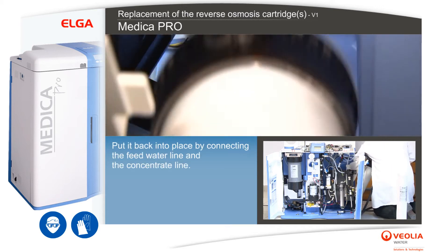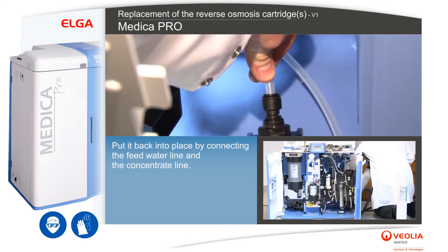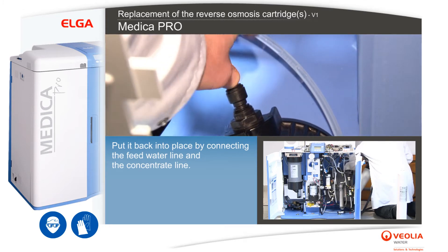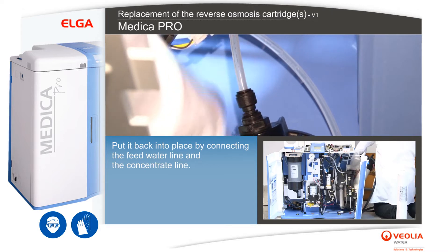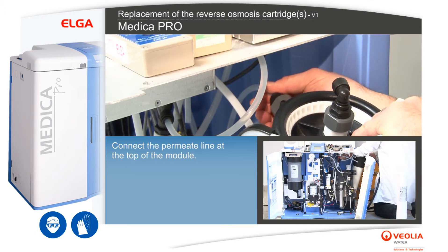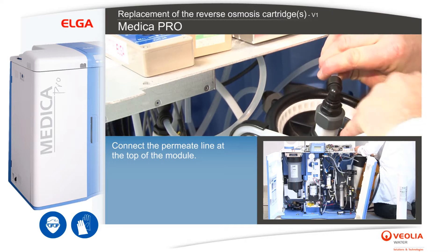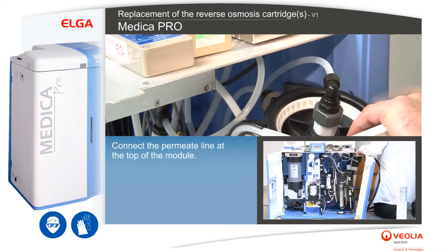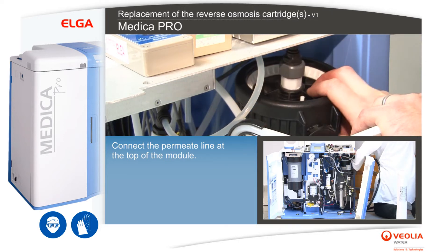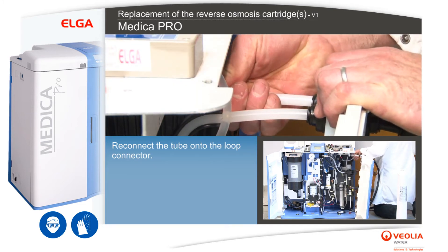Put the new module back into place by connecting the feed water line and the concentrate line. Then connect the permeate line at the top of the module. Reconnect the tube onto the loop connector.